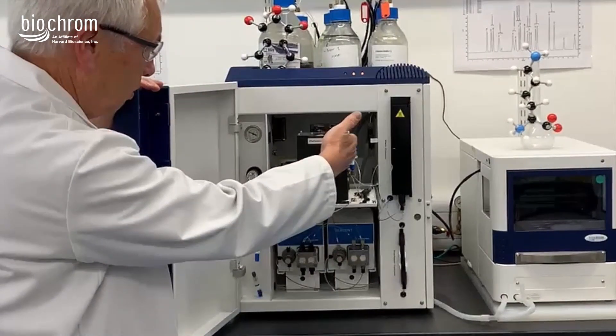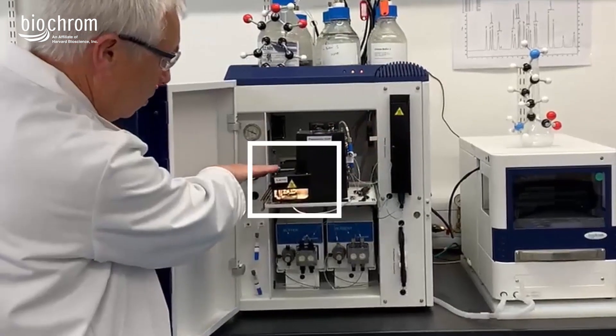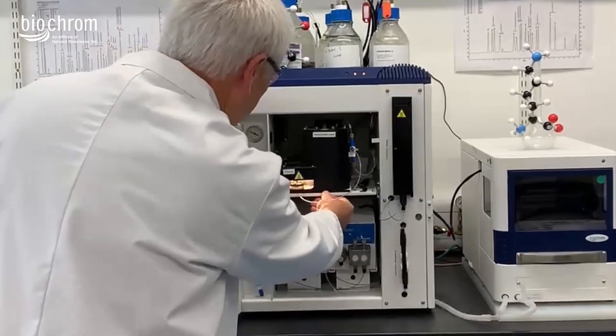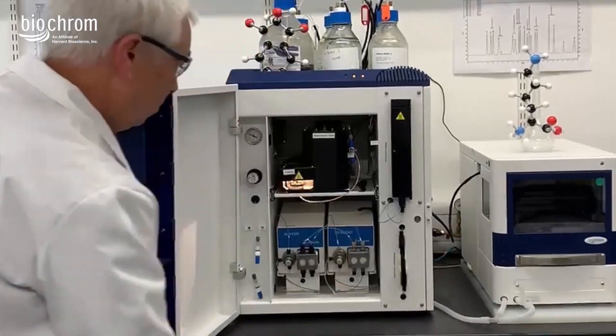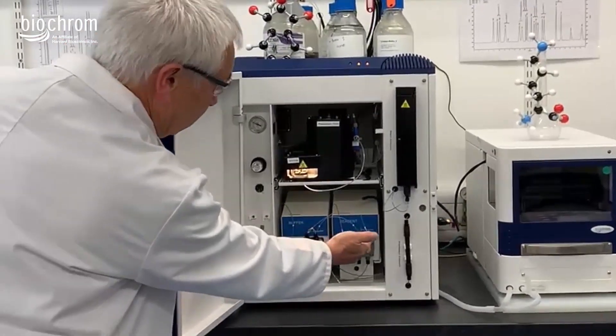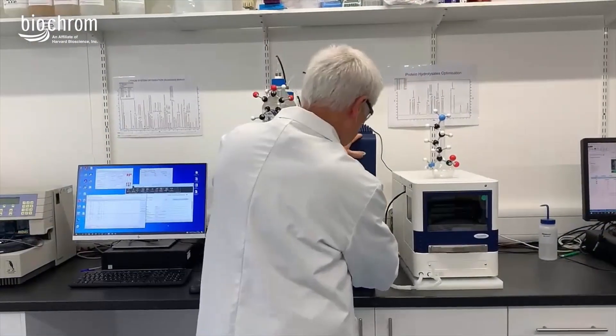That large box on the top shelf is the reaction coil — that's where the chemical ninhydrin binds to the amino acids to cause a color change, which we then detect in that little box next to it, which is the detector. You can see the light shining through there as the samples pass under it. Obviously these samples and chemicals all need to be pumped around the system, so we do have some pumps in there — these are peristaltic pumps and HPLC pumps.